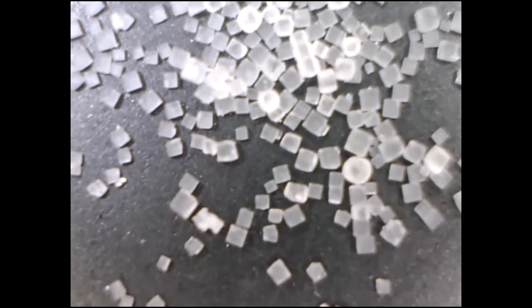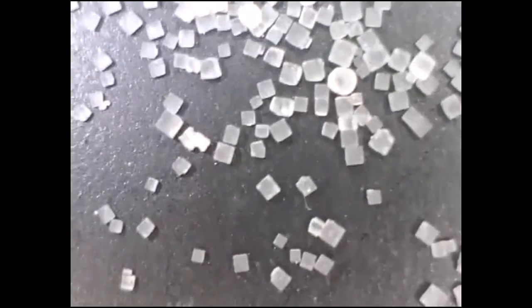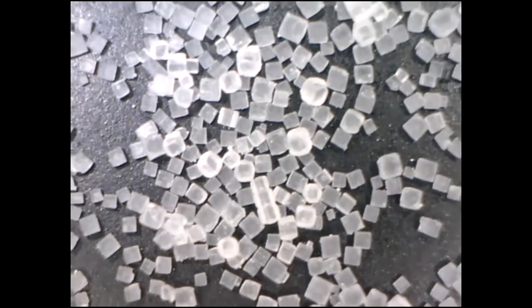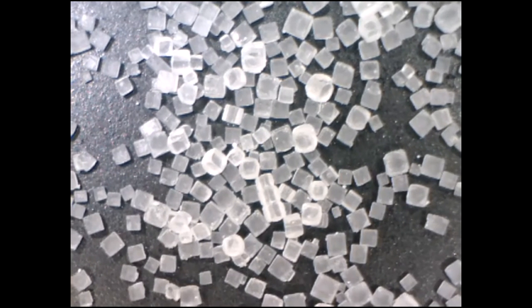So I'm gonna flip to this guy here, and it's gonna look black until we go up close. This is, like I said, a microscope. It's not as good as the ones used in bio, but if you put it really close, it's pretty amazing actually. So this was A, the one on the left. They're shiny, they're crystalline. The focus is pretty good.